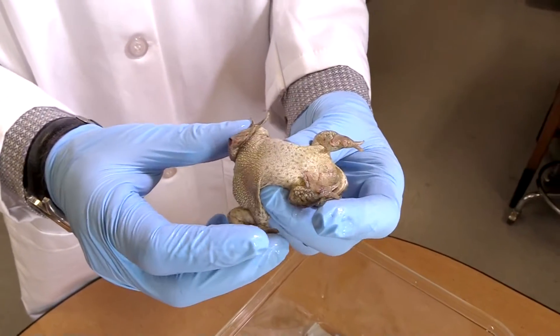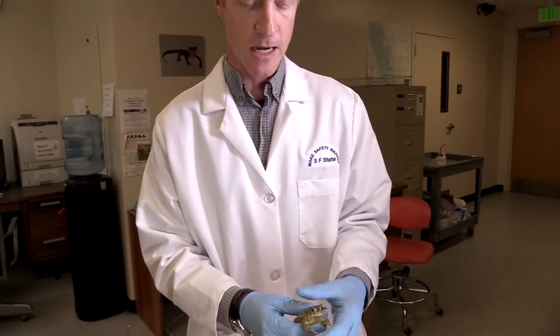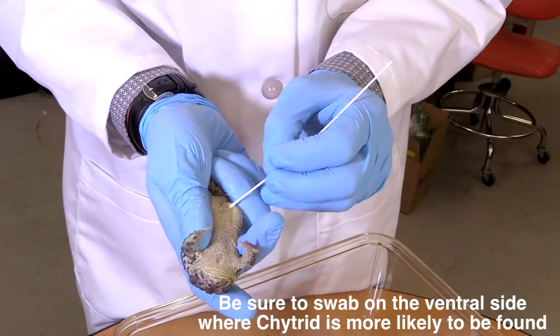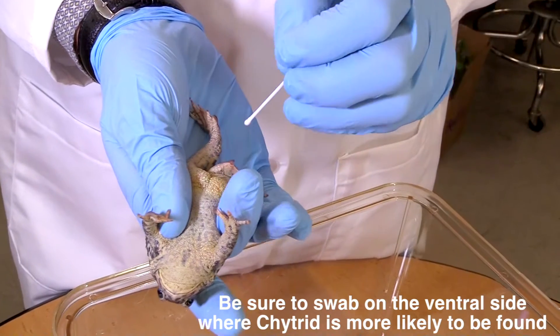This technique doesn't take very long, and it is not meant in any way to harm the animal — and it doesn't if you do it right. Flip the guy over. BD infections tend to happen on the lower side of the animals, on the ventral side.